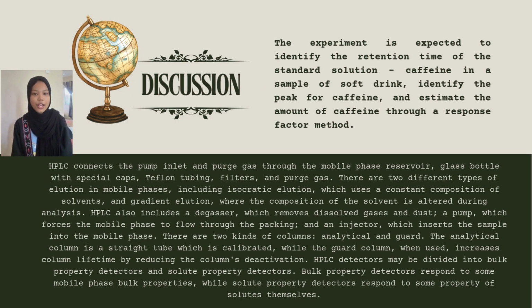Hi, my name is Nur Elena Batrisha, and I will explain about our discussion. The experiment is expected to identify the retention time of the standard solutions, caffeine in a sample of soft drink, identify the peak for caffeine, and estimate the amount of caffeine through a response factor method.